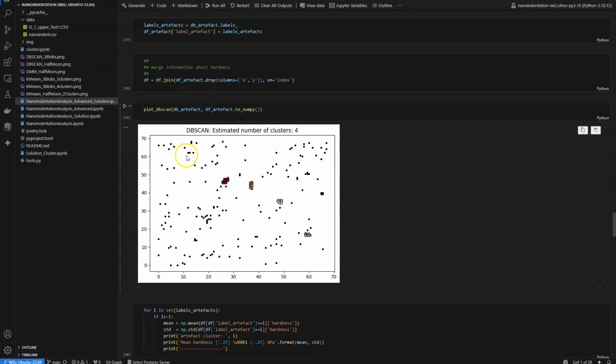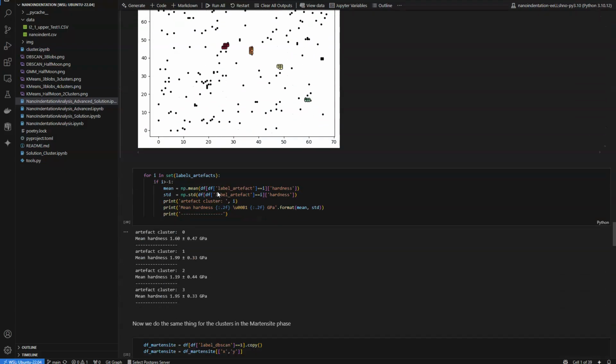Then we still have all the noise, so this is what we could, for example, then remove and clean up from our data sets, and we have found and identified our artifacts where there are some holes you see underneath the material.